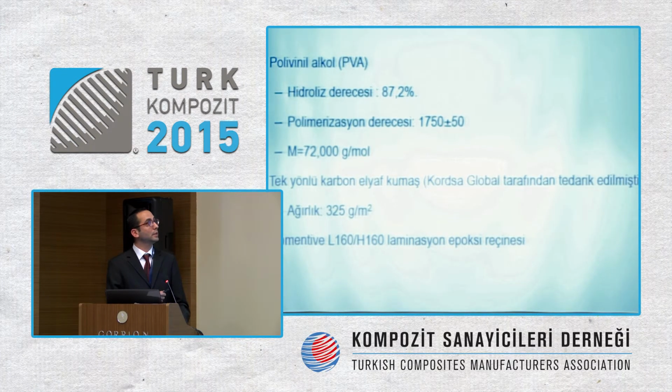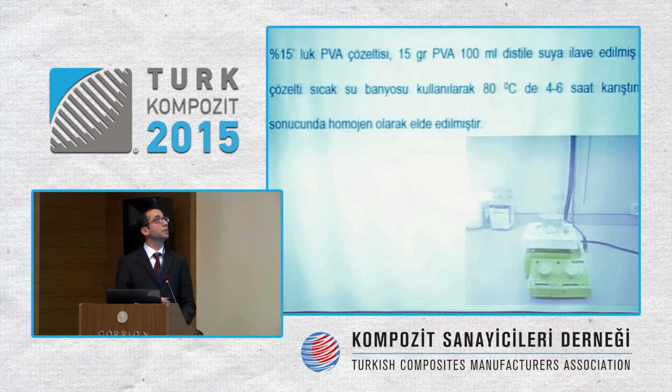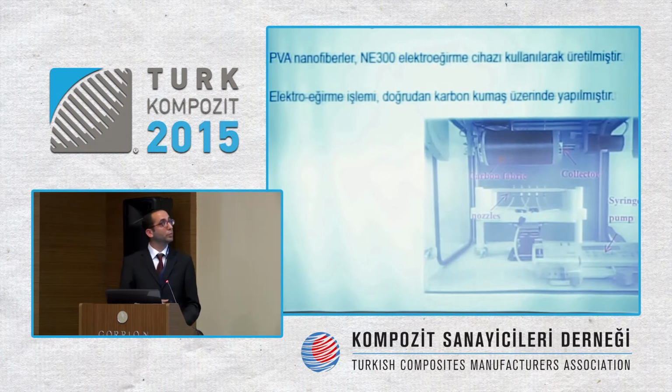Hydrolysis level is 87.2. Polymerization is 1750. Single directional carbon fiber, and the weight of it is 325 grams. For electrospinning, we prepared the PVA solution, 15% of it, with 15 grams of polyvinyl alcohol. In hot water bath, the solution was acquired.